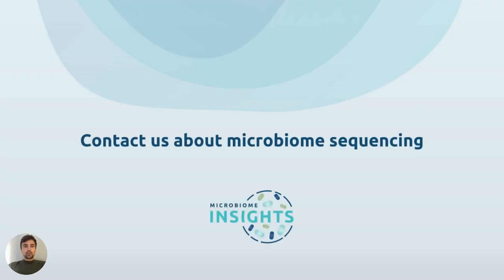In conclusion, shotgun metagenomic sequencing is a powerful tool that enables us to explore microbial diversity and function in great detail. Its applications span across environmental science, healthcare, food safety, and industrial processes.